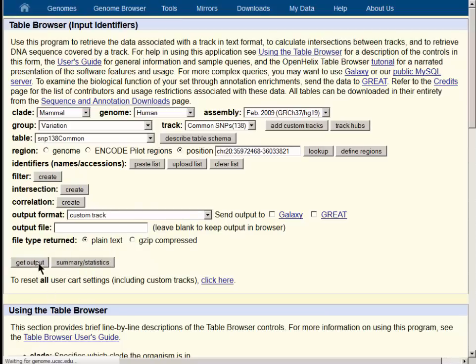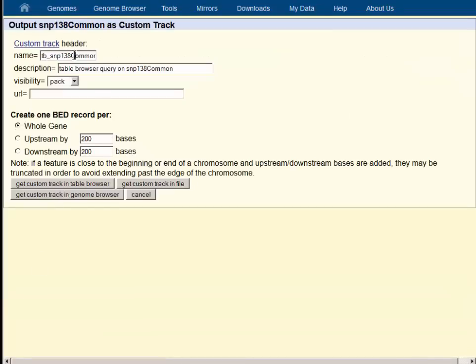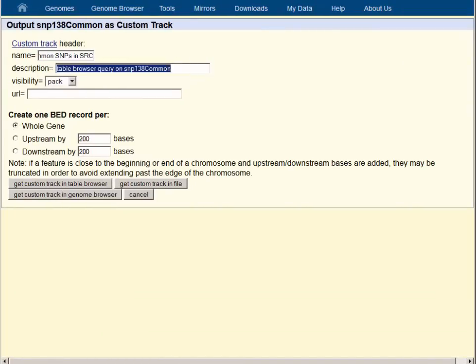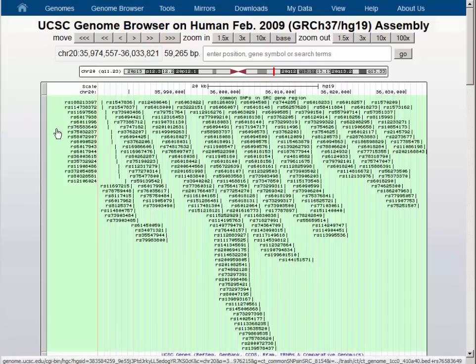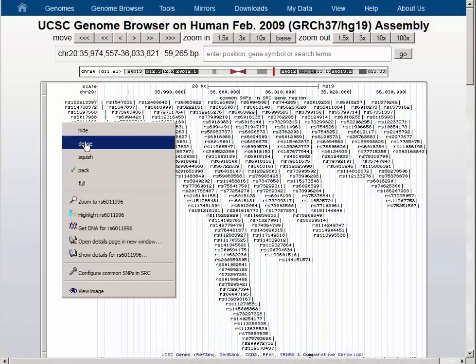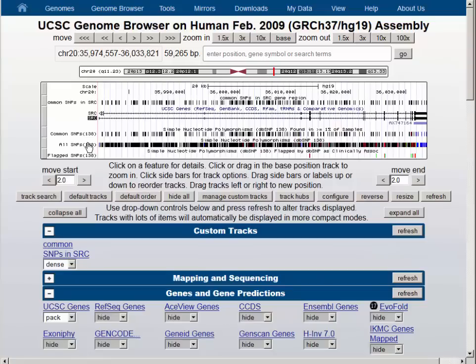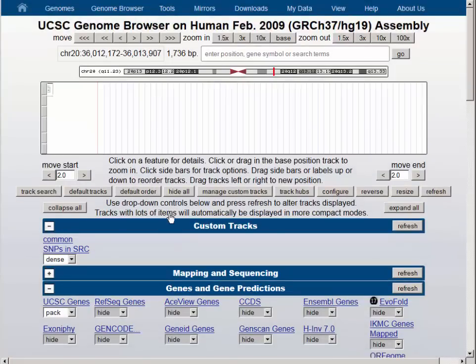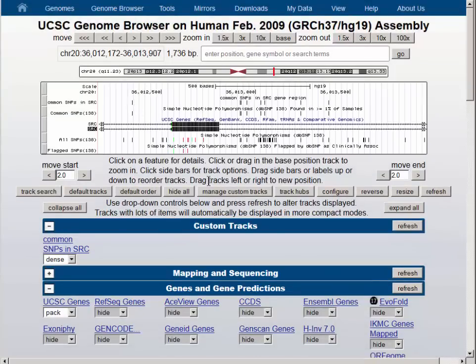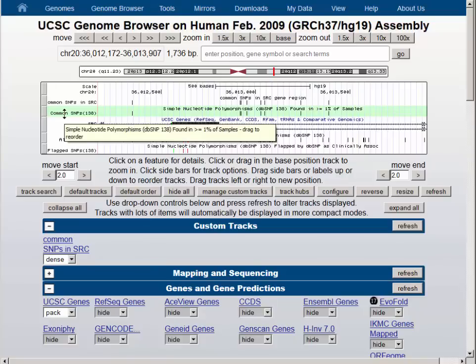The Get Output button takes us to a place where we can label our track. We'll call it Common SNPs in SRC, and we will call the long label Common SNPs in SRC Gene Region, and use Get Output to see the custom track. We will go over to the genome browser and view them. We can see the RS numbers and the tick marks corresponding to them. We will collapse them down into dense. The Common SNPs track can be moved up into place so they're side-by-side with the new track we just created. We'll select this exon over here so that we can zoom into the region and get a closer look. You can see that there's a match between our newly formed track and the original Common SNPs track from which it derived.